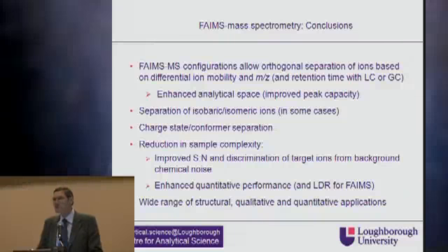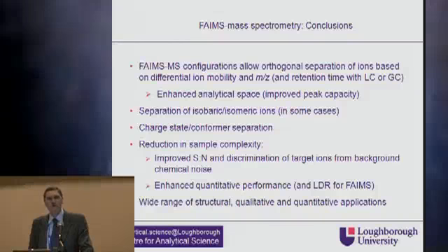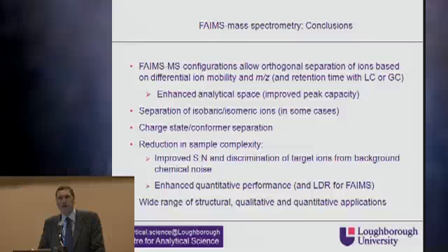And perhaps the most interesting of all, as mentioned earlier, one of the most important characteristics of FAIMS and ion mobility spectrometry, as far as I'm concerned, is that the same device, the same hardware, can do everything from tiny little ions up to great protein assemblies without any significant change in the operation of the systems. So we have a wide range of structural, qualitative and quantitative applications available to us.